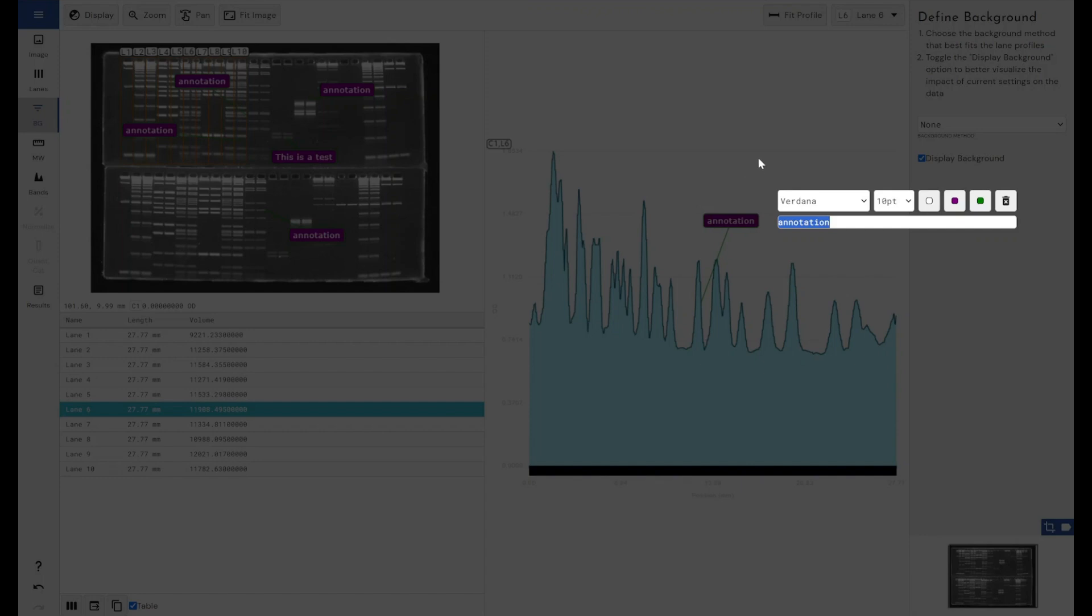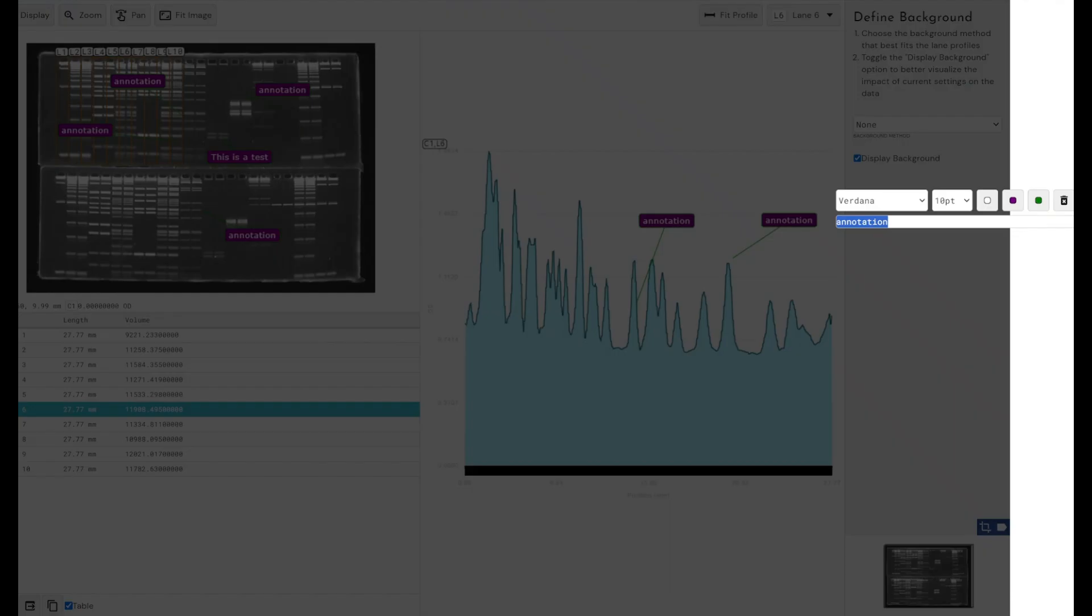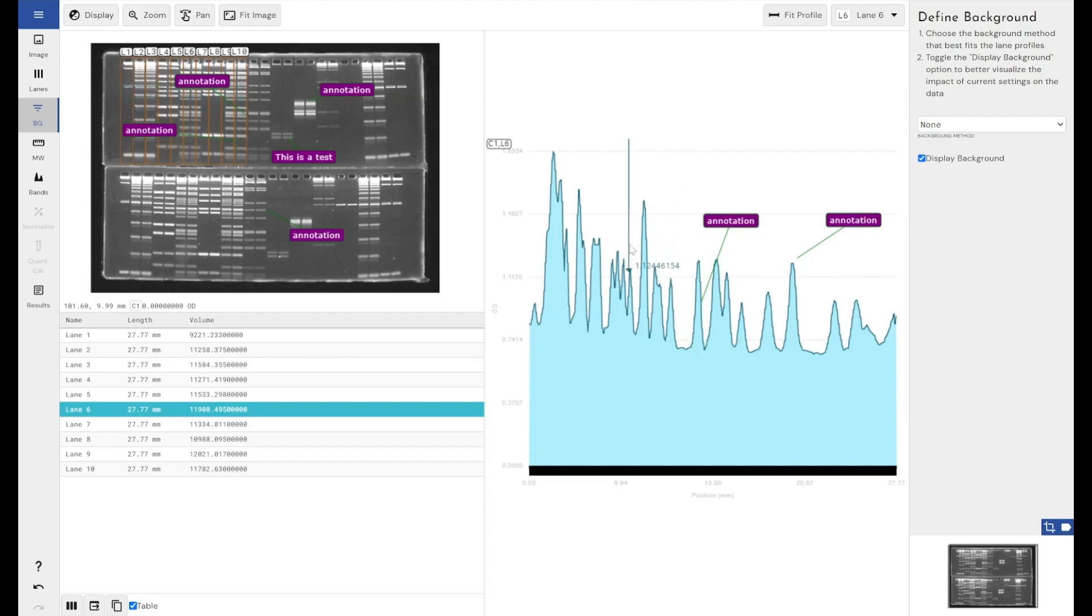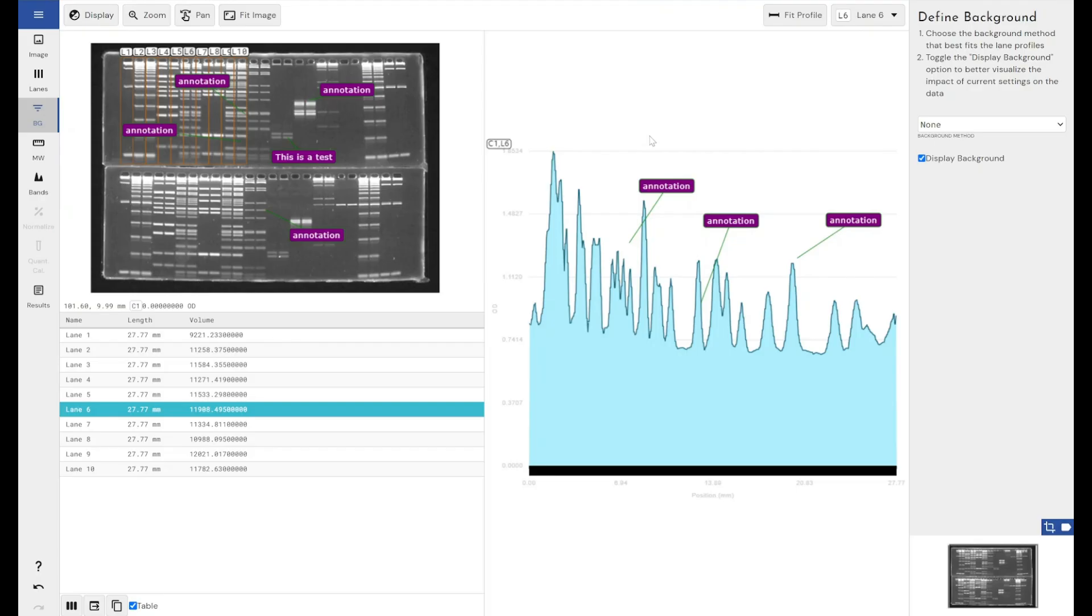Again, I've got all the same options. All this information is going to go into the report. I can add these where I want to.